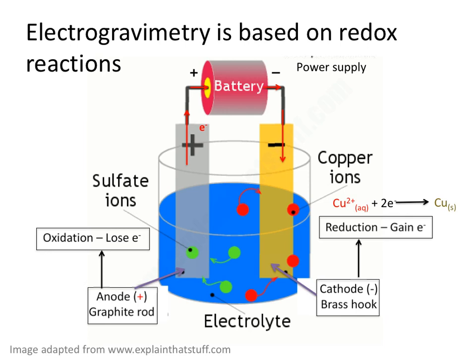To determine the concentration of the unknown copper sulfate solution, we will be making a crude electrochemical cell that will partially resemble the cell on this slide. In the cell, you can see an aqueous solution, which in our case will be a diluted copper sulfate solution. Concentrated acid is added to the copper sulfate to make the copper ions more accessible. Sodium sulfate is also added to maintain the charge balance as the electrochemical reaction is exhausted.